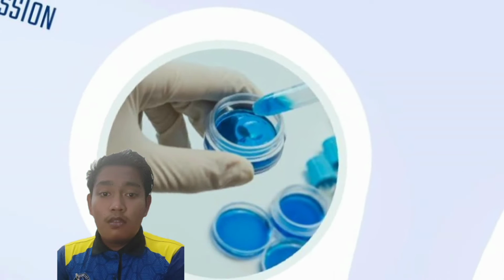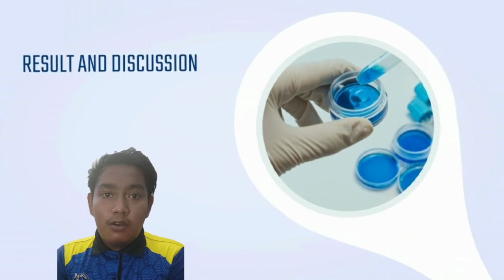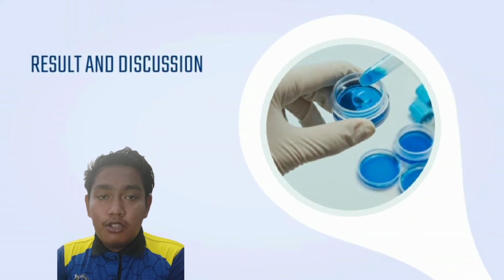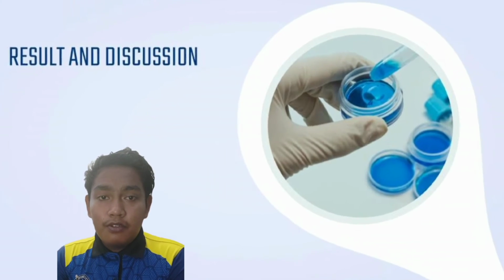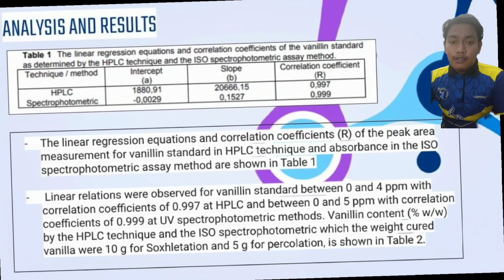Assalamualaikum warahmatullahi wabarakatuh. My name is Muhammad Firdaus bin Mahudin. Today I'm going to continue this presentation with the results and discussions about the determination of vanillin in vanilla essential oil by high performance liquid chromatography. Now we move to the results and discussions.